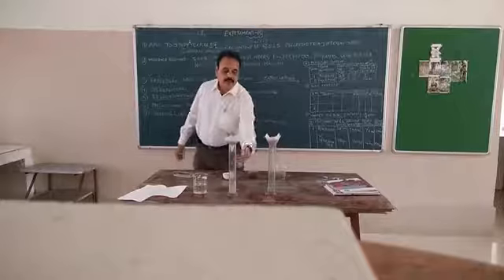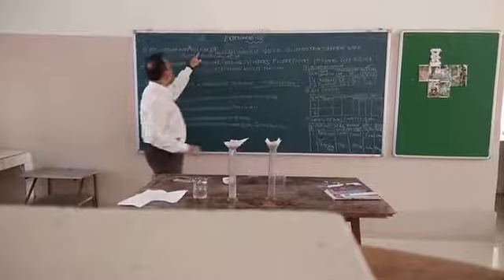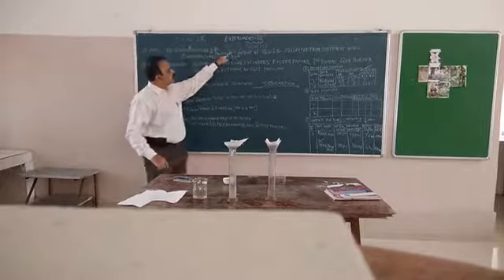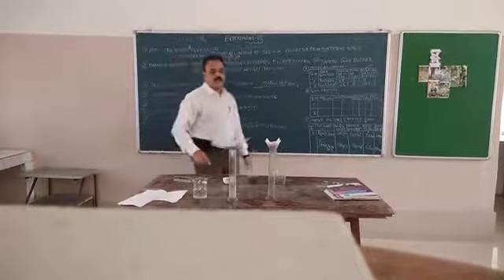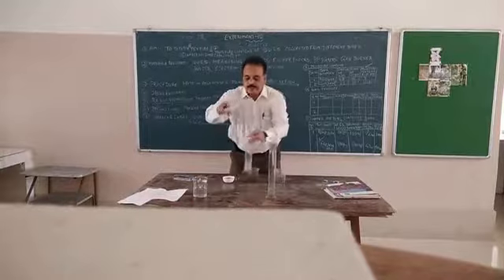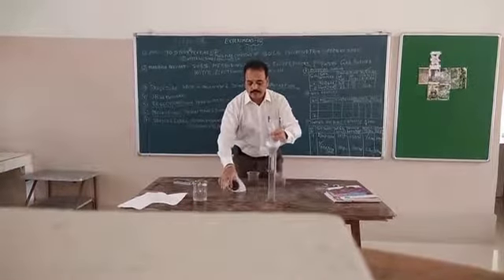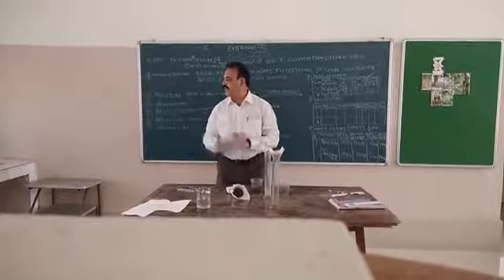So this is how we can measure all these three: texture, moisture content, water holding capacity, and of course, last, pH. Just take out this filtrate, put it in a small test tube, and we do the pH test.